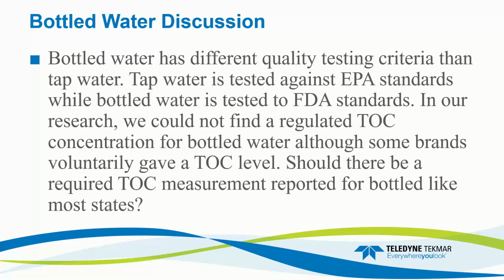So as we finish up the bottled water discussion, what do we want to talk about here? Bottled water has different quality testing criteria than tap water. Tap water, coming from our taps, is tested against EPA standards, while bottled water is tested against the FDA standards. In our research, we could not find a regulated concentration for bottled water, although some brands voluntarily gave TOC levels on their label.